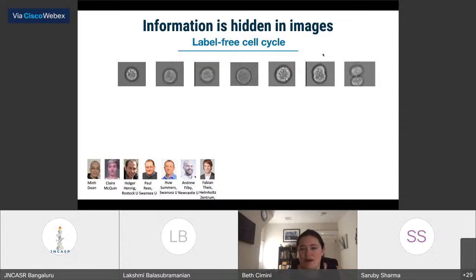So these are all bright field images of different cells in different cell cycle phases. Back in the time when I used to give this talk in person, I always took this point to ask, all right, who would like to tell me which cell is in which cell cycle phase? Never gotten anyone to raise their hand at that point. Because it's hard.